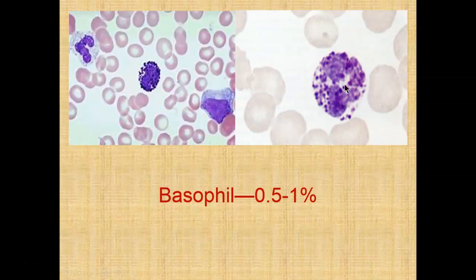Here are the basophils. Notice the purple-stained granules — not only is the nucleus stained dark purple, but the granules are as well. Your basophils are the least abundant of all leukocytes. Their numbers increase dramatically during allergic responses because their primary job is to release histamine into infected tissues or tissues responding as part of the inflammatory response. Those are your granulocytes: neutrophils, eosinophils, and basophils.